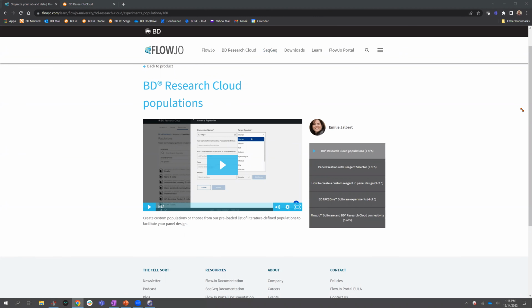Oh, question in the chat so far. Can you also create FACS Chorus experiments offline in addition to FACSDiva? Richard, that's a great question. So we cannot at the moment, but I think that's a great suggestion. And I know it's been a topic of discussion within our team to address that acquisition software as well. But at the moment, we can only do FACSDiva.